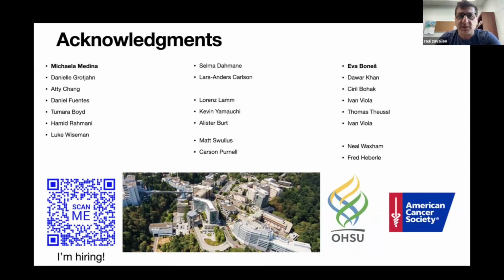Thank you very much. The question is, were you able to localize a protein fluorescence signal with your tomographs of the membranes, to see where the proteins are and the static structures around it? Yeah, that's a great question. What you're describing is a technique called CLEM that is certainly possible.